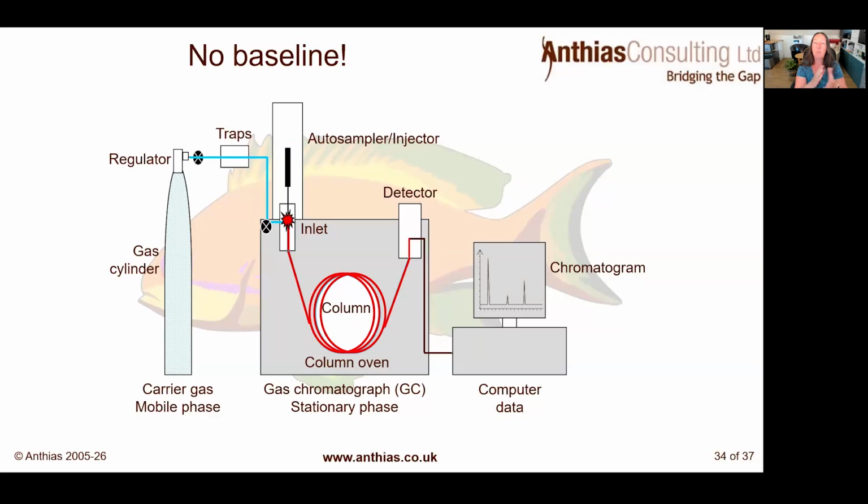If you've got something like a flame ionization detector, again, then maybe your auto zero isn't working properly. And actually, the background has reduced so much that it's gone downwards and gone below that zero set point, so it's not reducing it further. So again, you're cutting off the bottom of your chromatogram. So those could be problems in your software, in your parameters, or in your detector. But those are the first things that I'm going to have a look for.